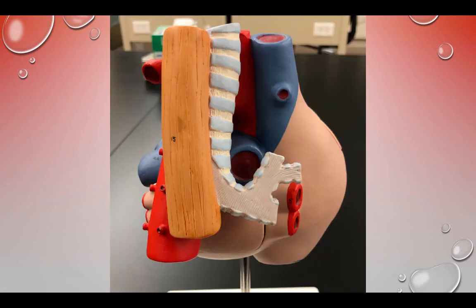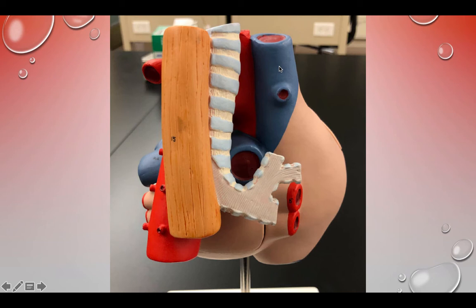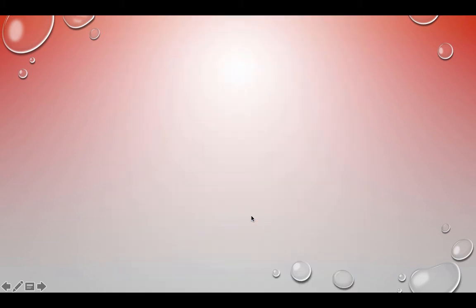This is showing you the back of the heart. You can see the esophagus and trachea. I won't quiz you on the posterior view because it's really difficult to identify the structures, but this is actually the superior vena cava, and these structures here are the pulmonary veins coming in. Just a slightly different view of the heart.